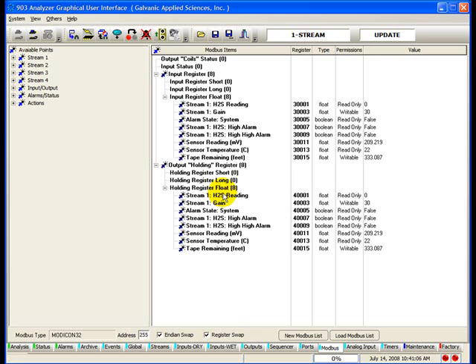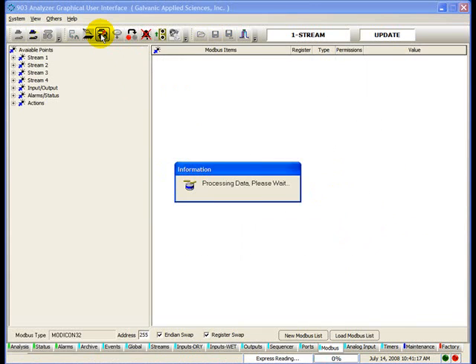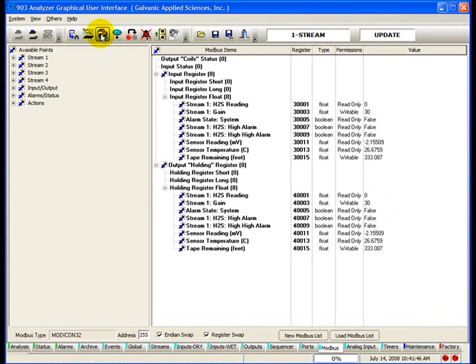Analyzer is now updated with the latest changes. The value table displays current readings for user convenience, and now you can see updated values. To do this, press the Poll Once button. This concludes the How to Set Up Modbus tutorial.